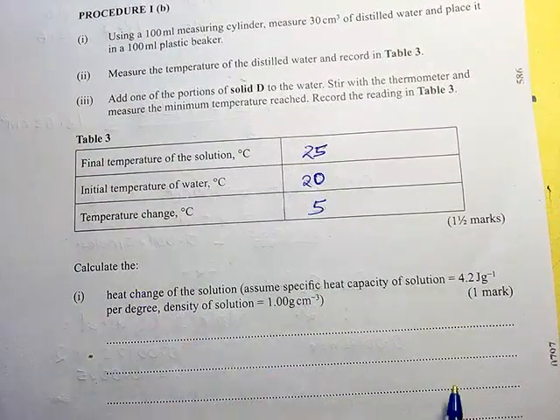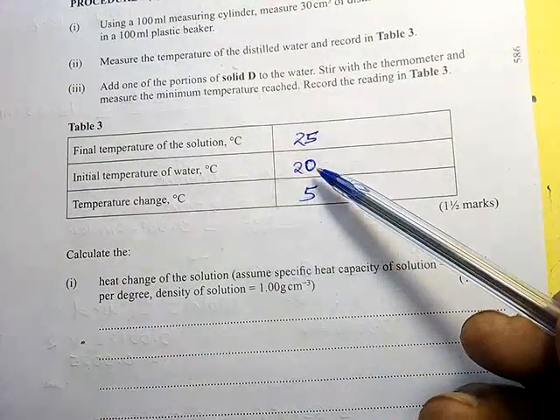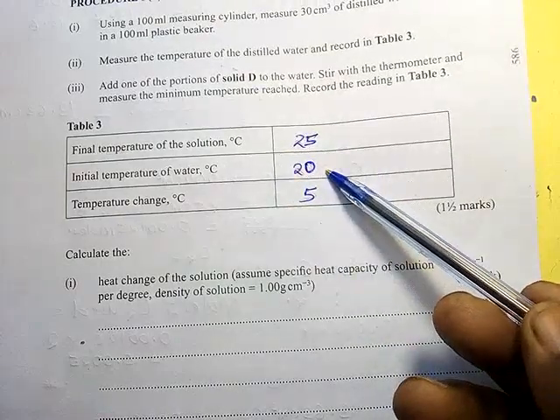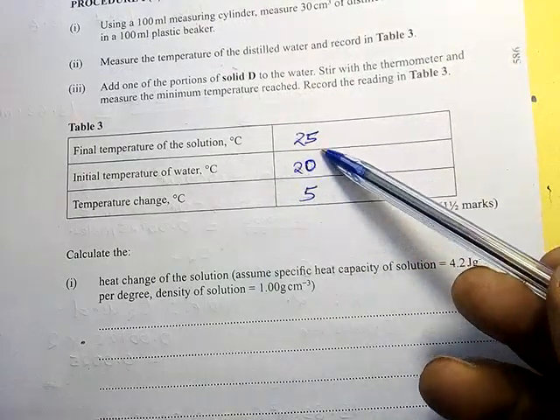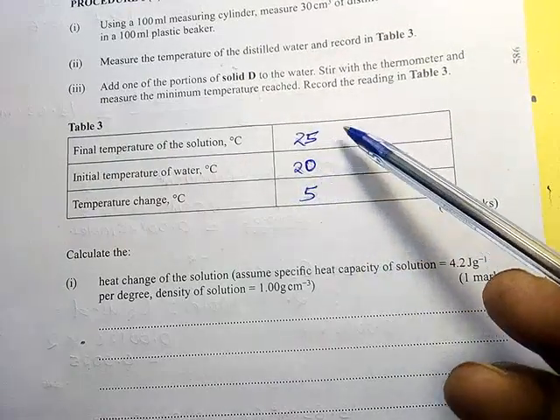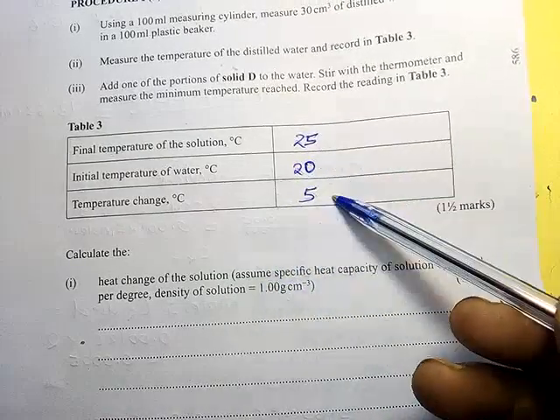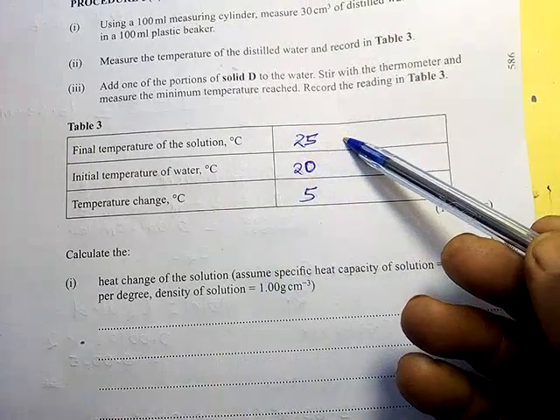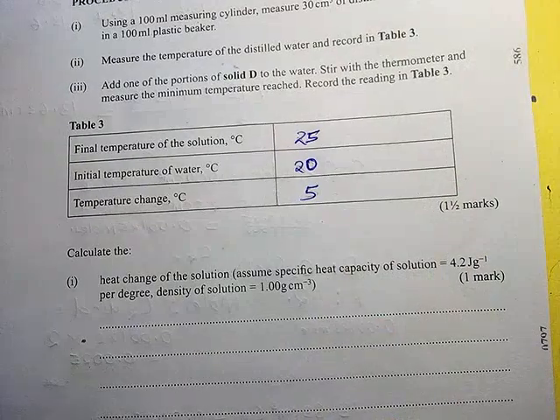Now let us go to the question. I'm saying that these temperature values here, every student will find their own. Others will get 27, here 22. It depends on the temperature of that room. So these values are actually not constant. They can vary. Somebody can have 30 here. Any value can work here. Depending on those people who are in Rodwa, they will have a very different temperature. They can have even 35. So it depends. So don't look at this one, then you find yourself that you failed. No, you didn't fail.